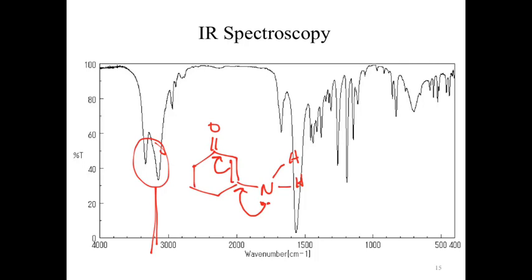Yeah, we could take a look again at our carbonyl. Okay, we said that that frequency was ridiculously low. Well, go back again to our structure here. What happens at the very end of that? We have a resonance structure that puts all of the electron density on the oxygen and no double bond between the oxygen and the carbon. Without that double bond, our frequency shifts lower and our carbonyl shows up at a much lower frequency. Okay, so we can explain those weird oddities in our IR once we have the structure. But until we have the structure, we're lost. Okay?